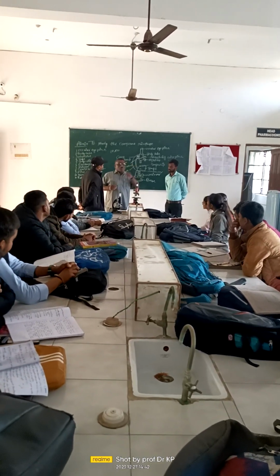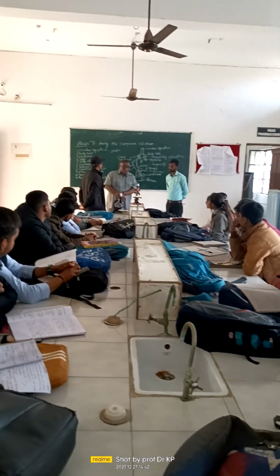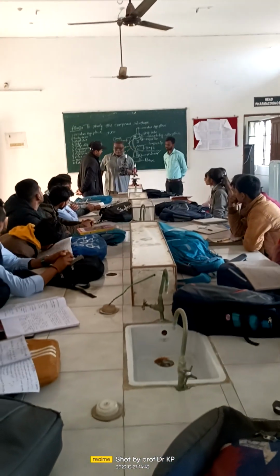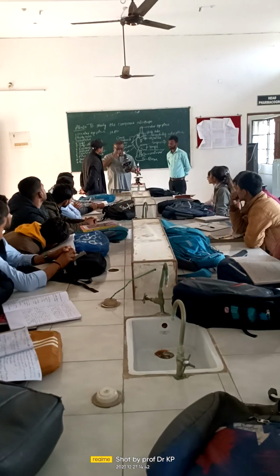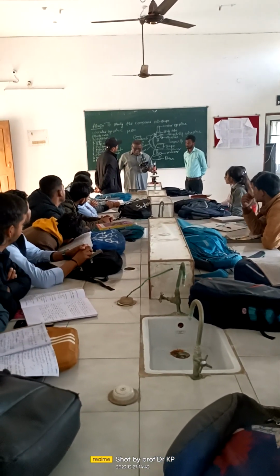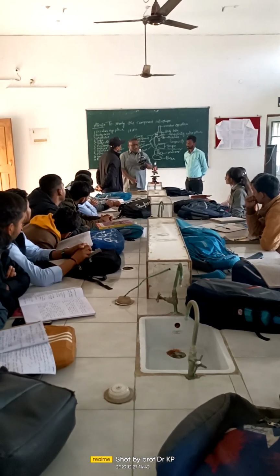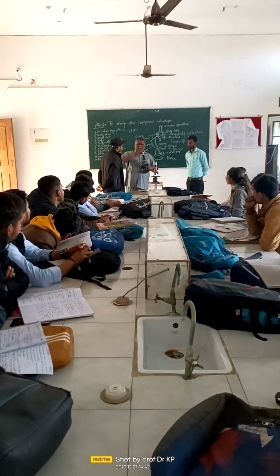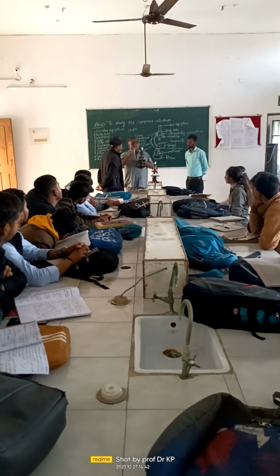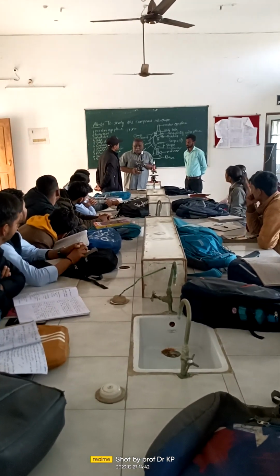Then came the next development called the compound microscope, in which there will be one eyepiece. That's enough. Okay? If it is going to be a binocular microscope, you will have 2 eyepieces. You can see at a time by using both the eyes. But usually the simple microscope or compound microscope used in the laboratory will be having one eyepiece. One into multiple is called a compound microscope.